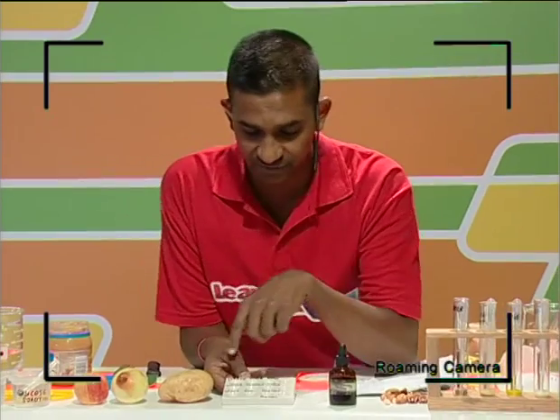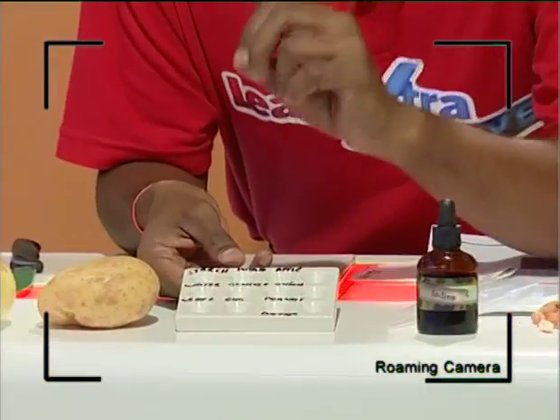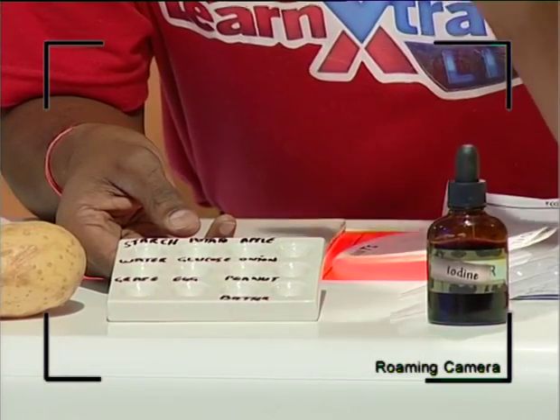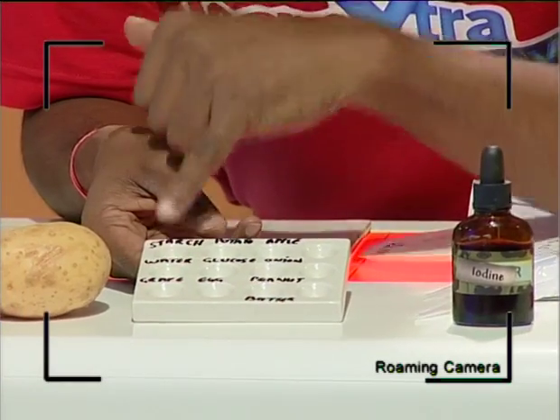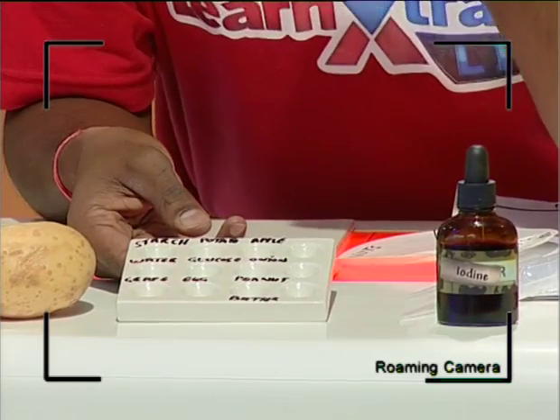So on the spotting tile, guys, if you look very carefully, I've labeled these different wells. Essentially we're going to put the different samples into these wells, and we're going to drop in a few drops of iodine, and we're going to look for color change. The first one is starch, and that is the positive control, and the next well is water.